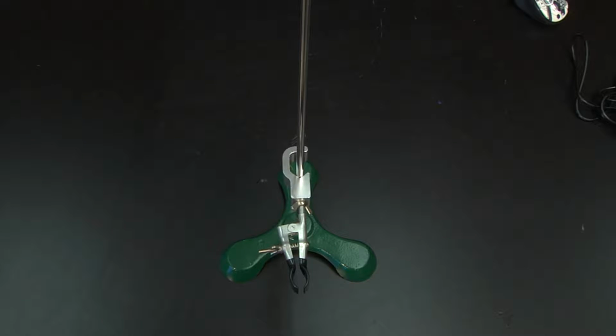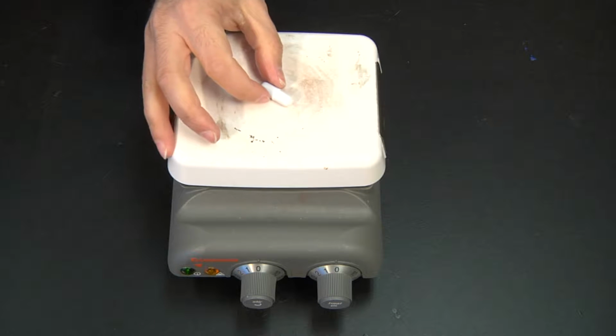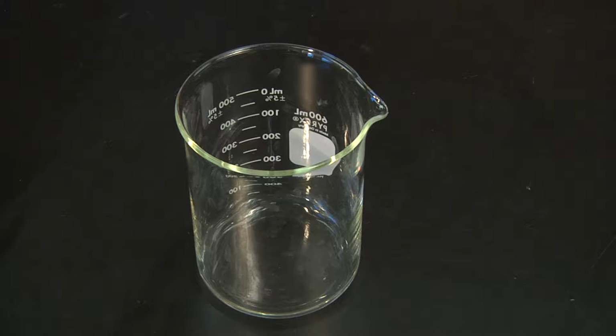A ring stand and clamp to support and secure the sensor during data collection. A magnetic stirrer and a stir bar to stir the solution in the beaker, or use a glass stirring rod. A wash bottle to clean your conductivity sensor in between experiments. Another beaker to use as a waste container.